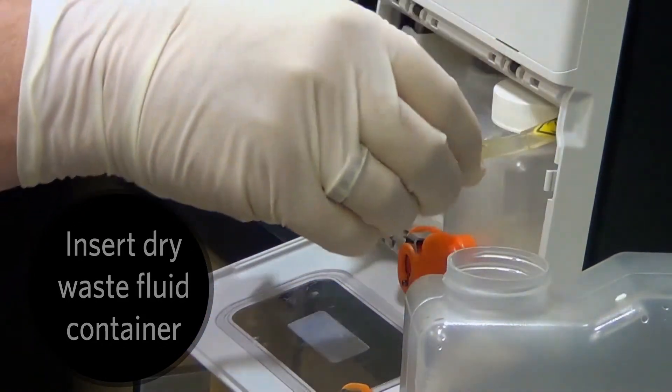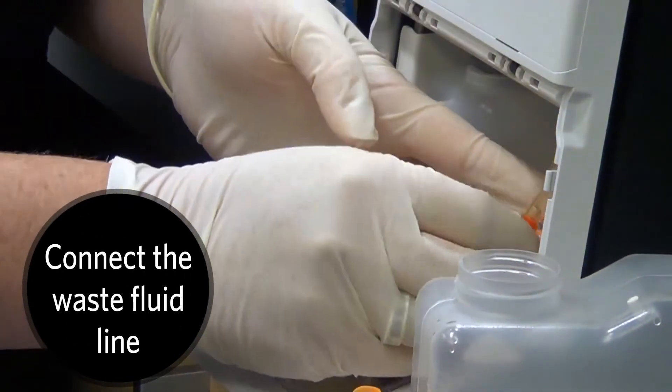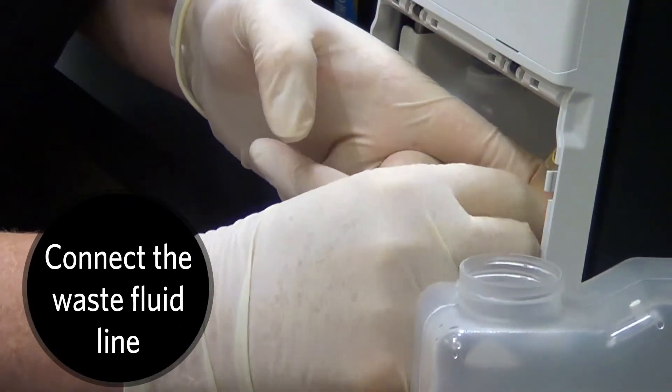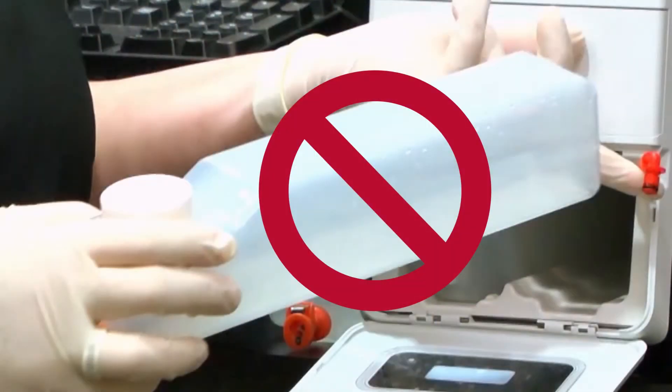Insert a dry waste fluid container into the fluid compartment and connect the orange waste fluid line. Note, make sure the replacement waste fluid container is completely dry with no condensation. Otherwise, the empty container will continue to trigger a waste bottle full message.